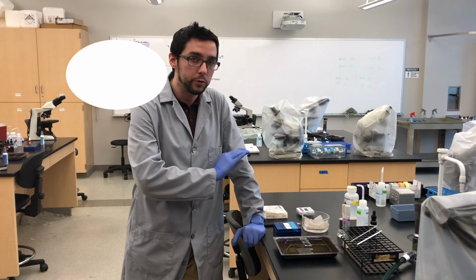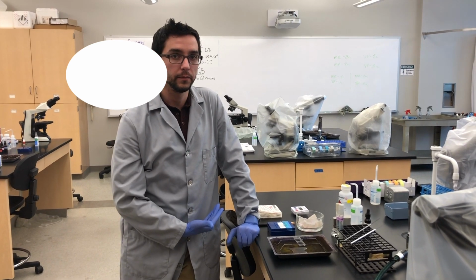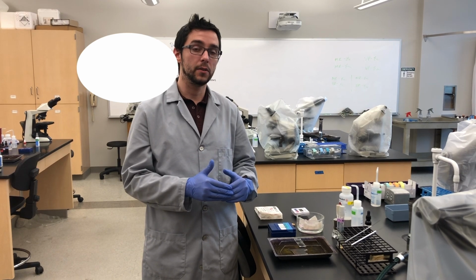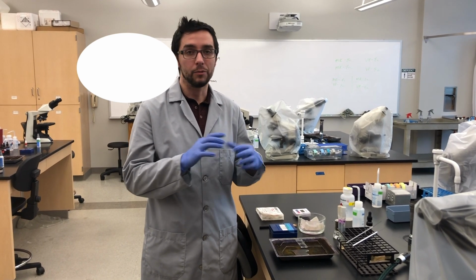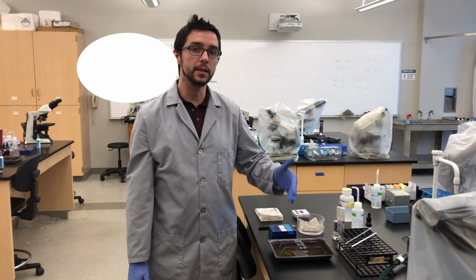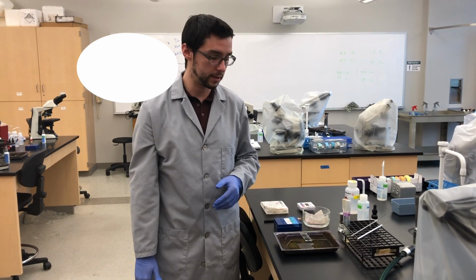Now, after we decolorized, any excess red got washed off the cells. Okay? So now, unless it's an acid-fast stainable cell, that red is not going to be present. The blue is simply coming in to stain any cells that do not now have stain on them after they've all been decolorized. Okay?